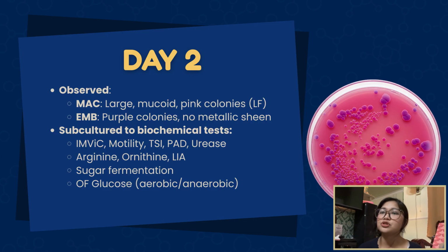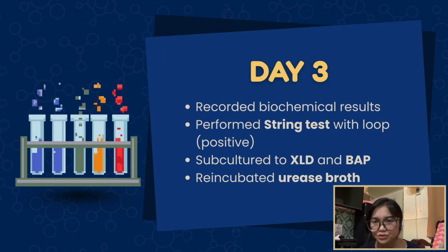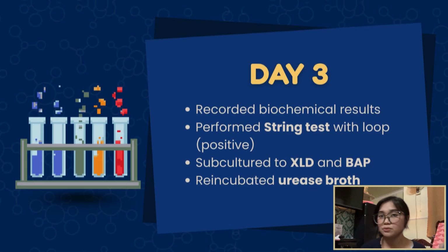I then subcultured the organism to different biochemical tests such as IMViC, motility, TSI, PAD, urease, amino acid decarboxylase, sugar fermentation, and OF glucose tests. And then on day 3, I recorded the biochemical reactions, performed the string test, and inoculated the organisms onto XLD and blood agar plates. I also re-incubated the urease broth.